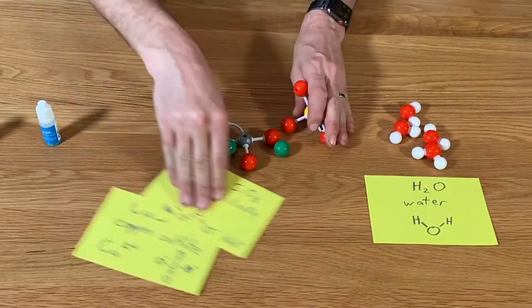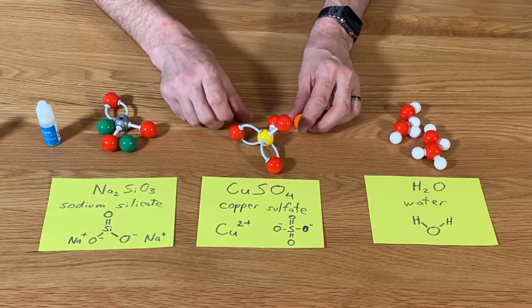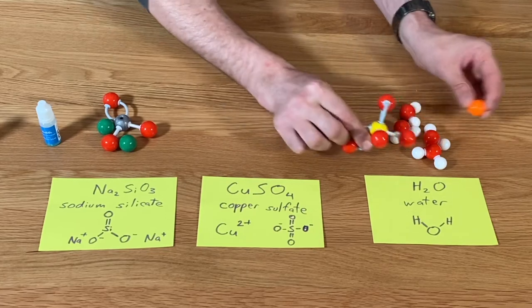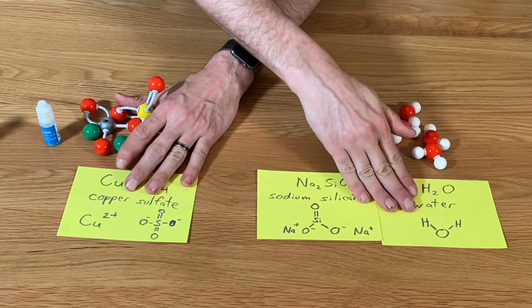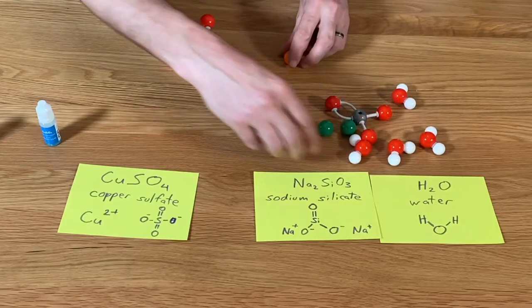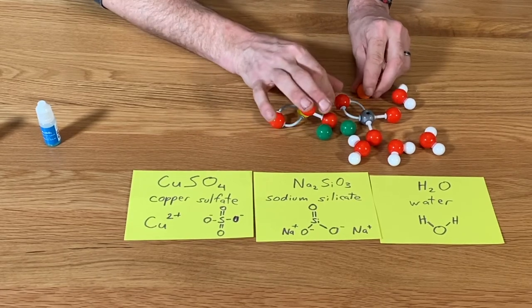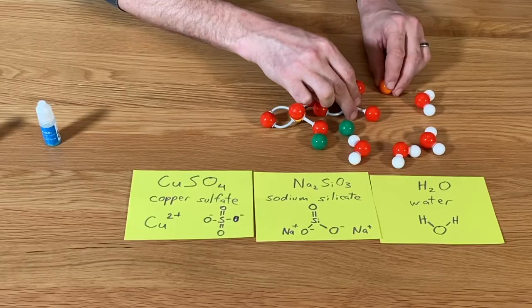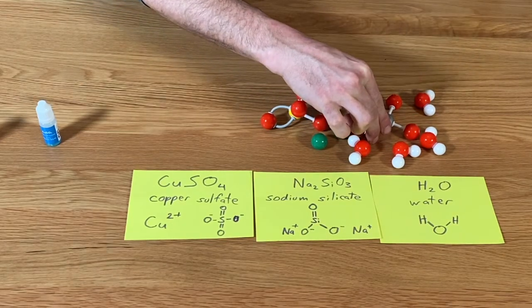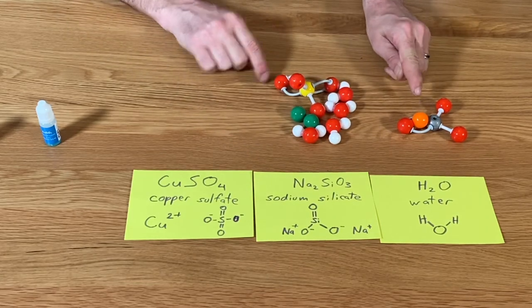Now the other reagent we are using is copper sulfate — very similar to sodium silicate. Four oxygens, two double bonds, and then two free oxygens, giving a charge of negative two. Copper has a charge of positive two, and that binds to these two. Normally when you throw it in the water, they flow around — no big deal. However, when we throw copper sulfate into our liquid glass mixture where everybody's just floating around, the copper bounces off, but due to its properties it says 'hey, silicate sodiums, I'm going to form a very strong bond with you' — and then it forms a solid, dropping to the bottom. Meanwhile, some sodiums come and hang out with some sulfate. And that's what you're seeing formed with the jellyfish.